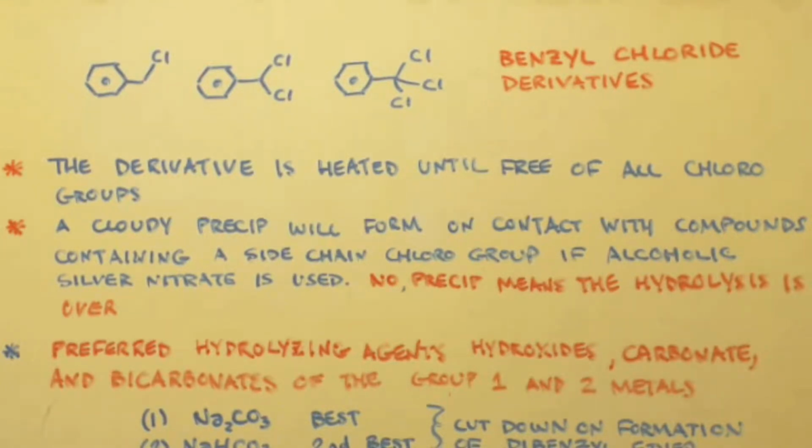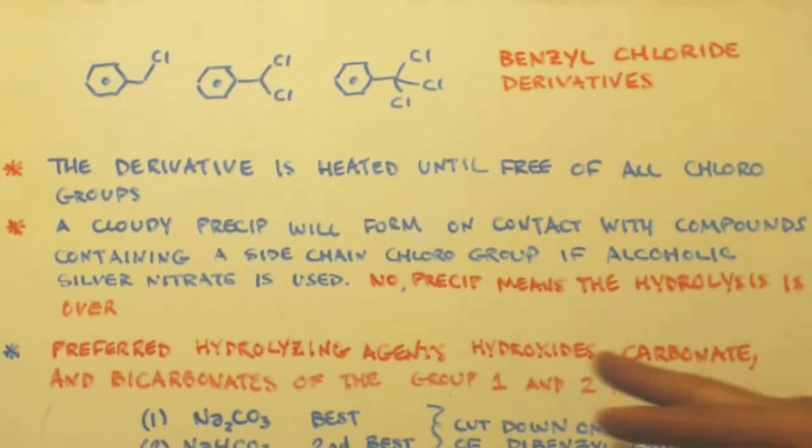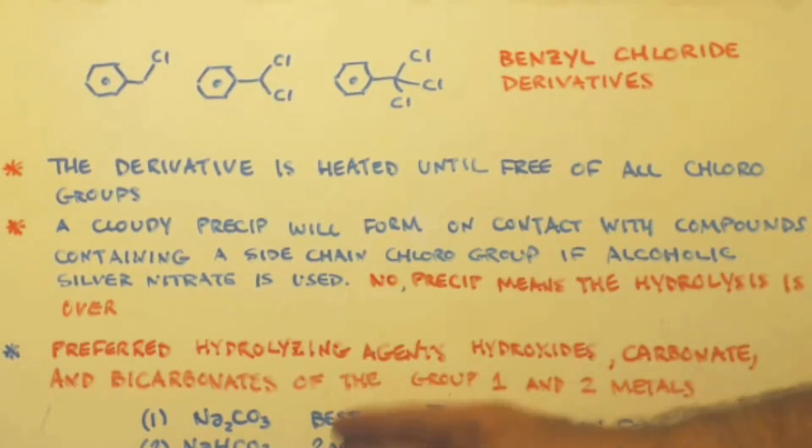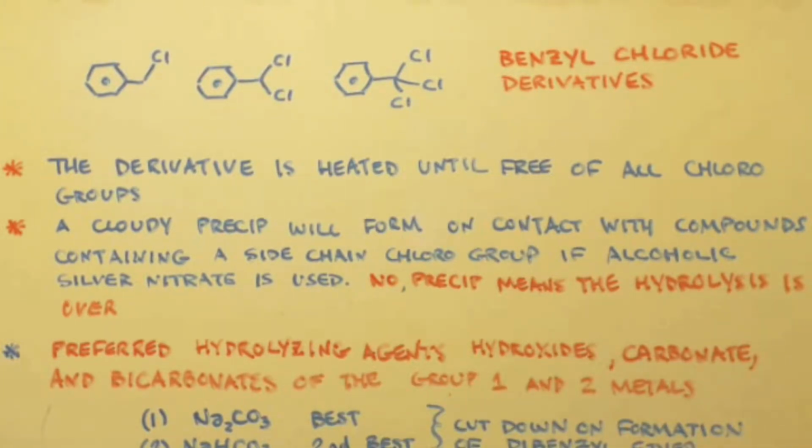Now, what's the preferred hydrolyzing agent? Hydroxides, carbonates, and bicarbonates of group 1 and group 2 metals. That's the preferred agent to use, okay? What are the three best ones? Right here. The third best one is sodium hydroxide.